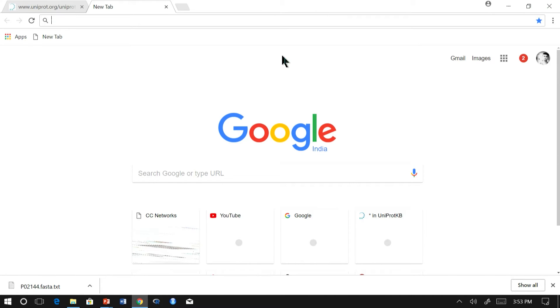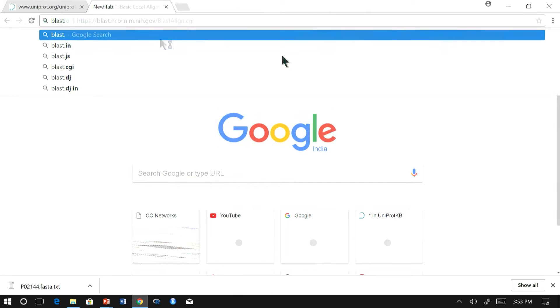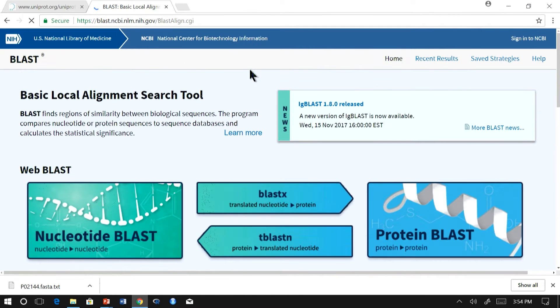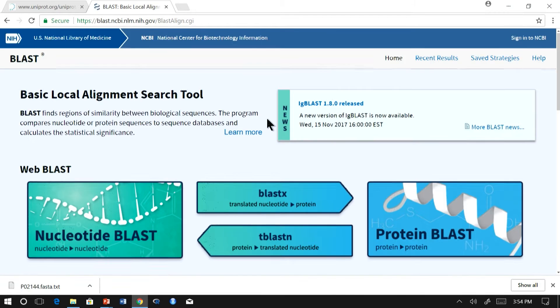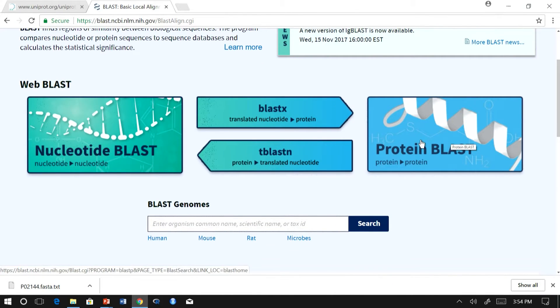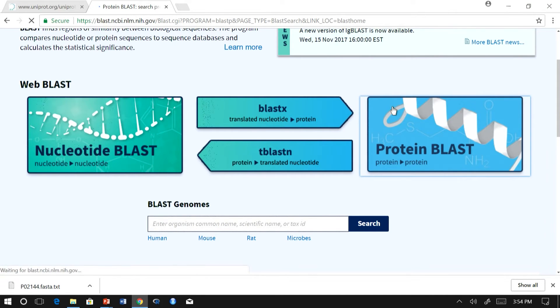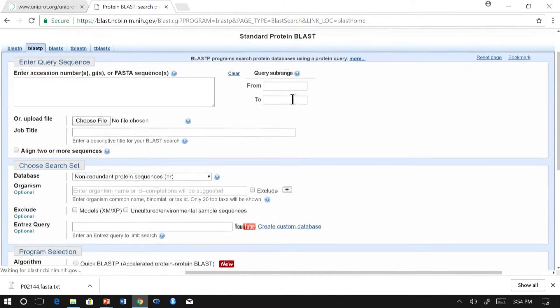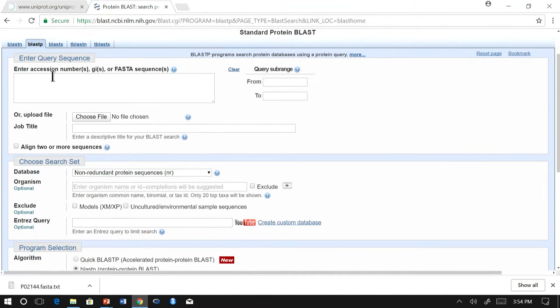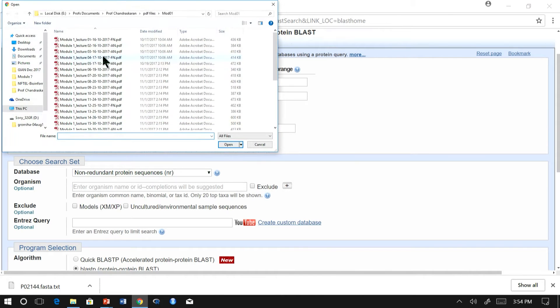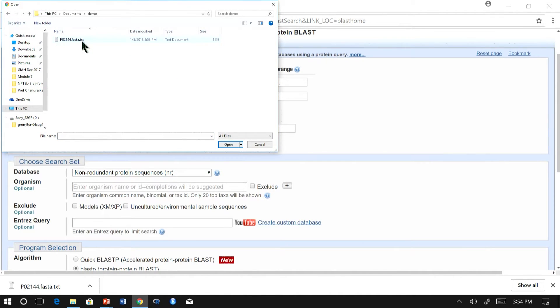Let us go to BLAST site. Let us use protein BLAST, BLASTP. We can either enter the accession number or the UniProt number directly, or we can upload the file which we downloaded.